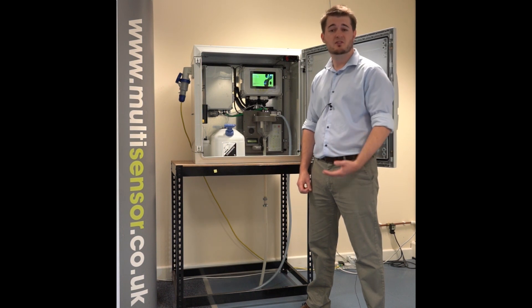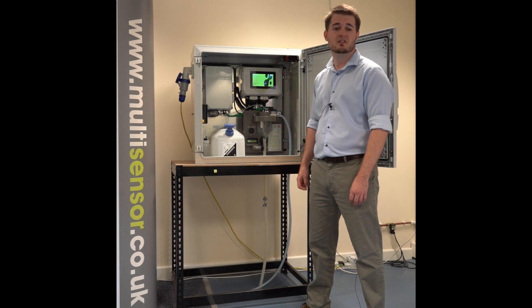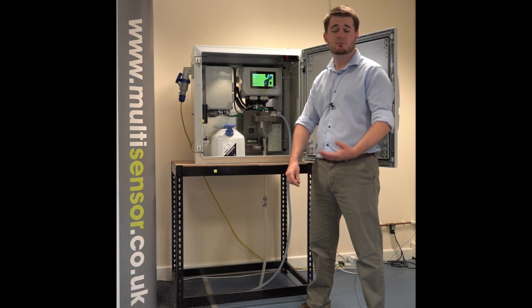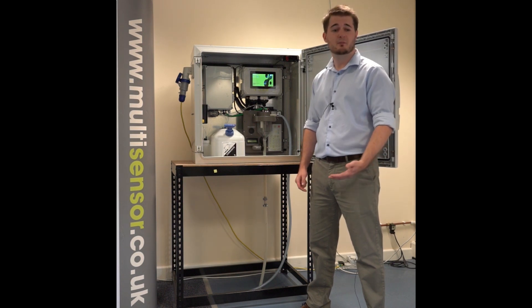Thanks to this arrangement, the sensors will never touch the wastewater and the wastewater is always handled by the specialised sampler. This means we don't need to clean the sensors and the instrument itself can run between three to six months with little maintenance.